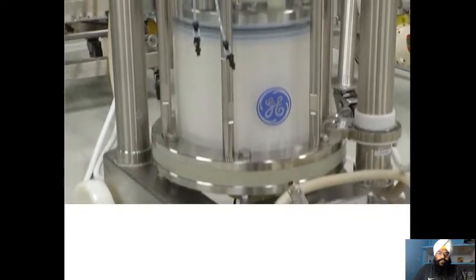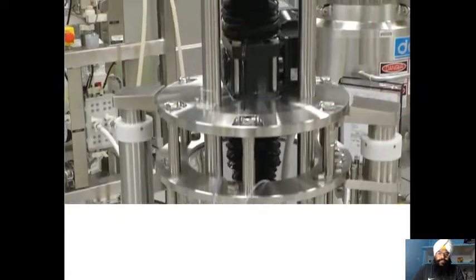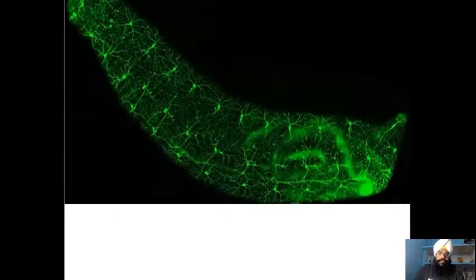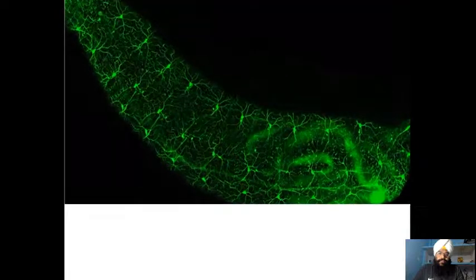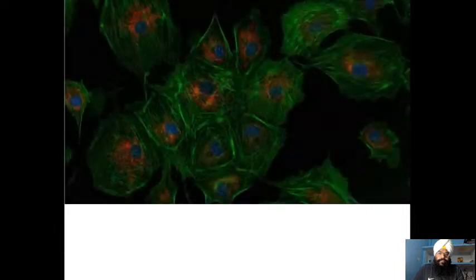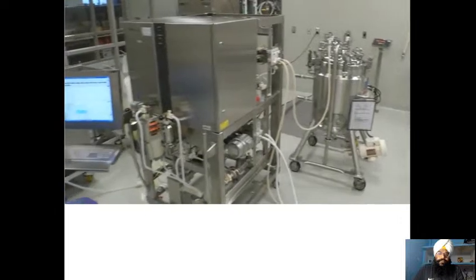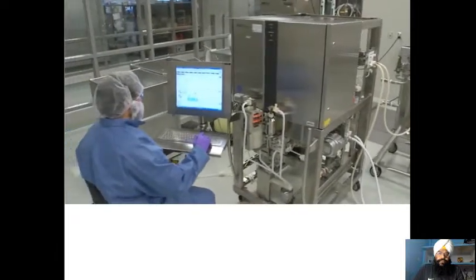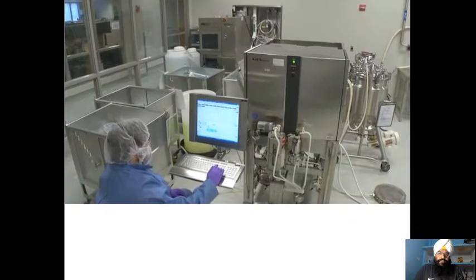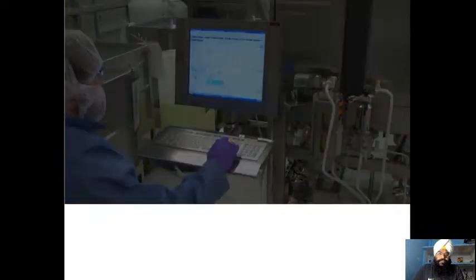In this program, we're going to look at a typical purification process used in the manufacture of GFP, green fluorescent protein. GFP is broadly used as a biological marker because it's very well tolerated by most cells and doesn't interfere with normal cellular function. We'll examine the technologies, equipment, and materials used, how to prepare for the process, and how the GFP purification process is managed, step by step.